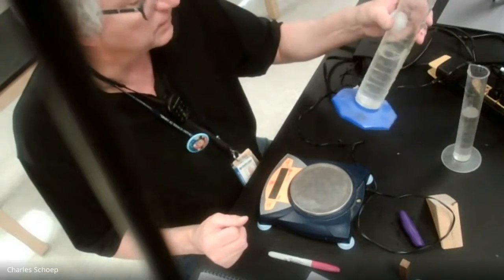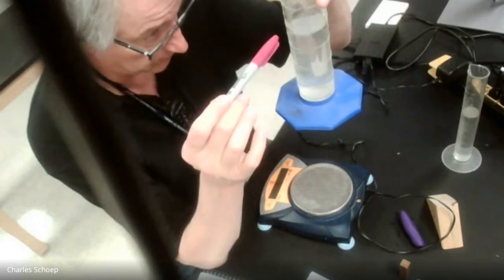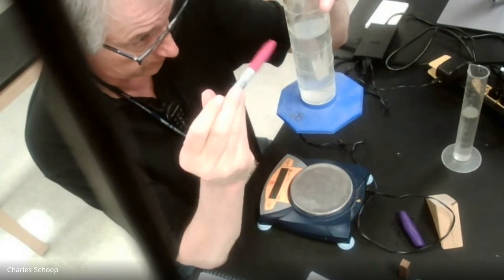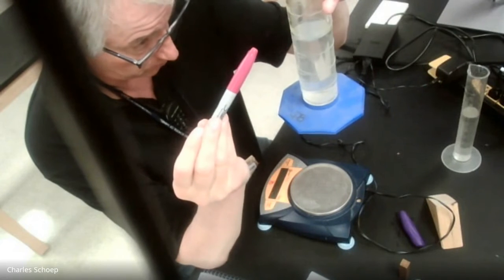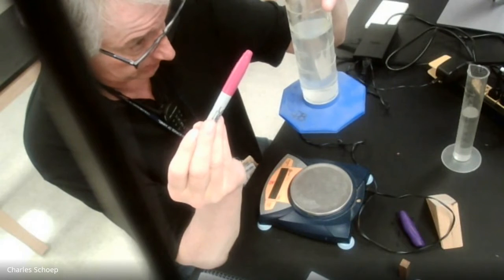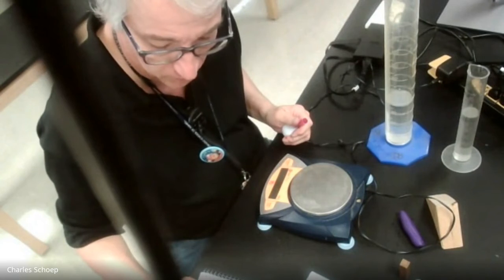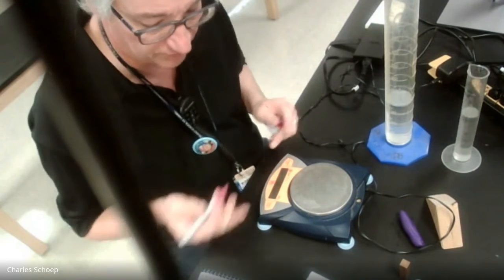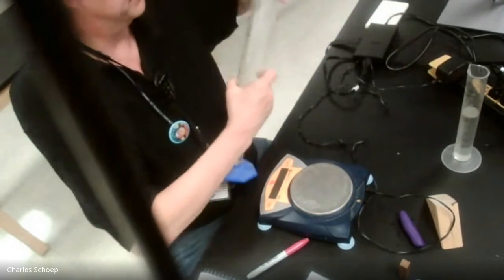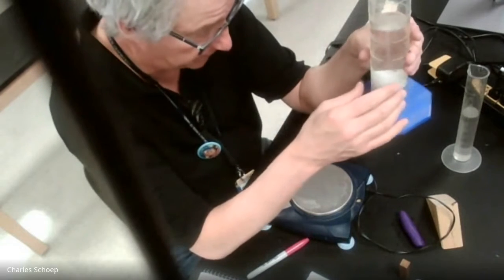I'm going to grab a graduated cylinder. I'm going to measure the initial volume. The initial volume is 165. And I'm going to drop the golf ball in. I'm going to roll it down the side so it doesn't splash.